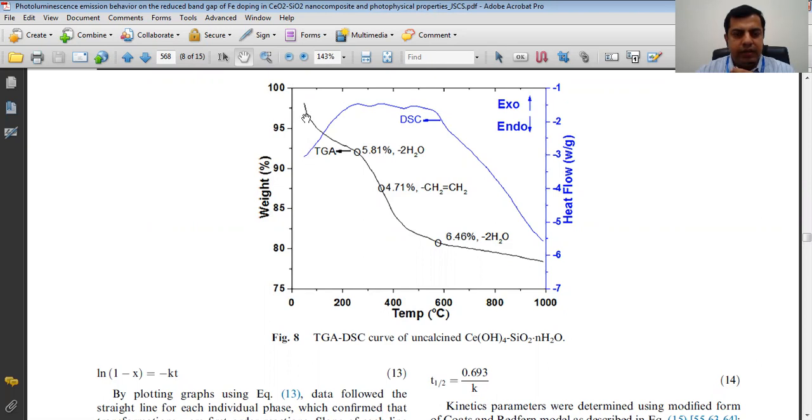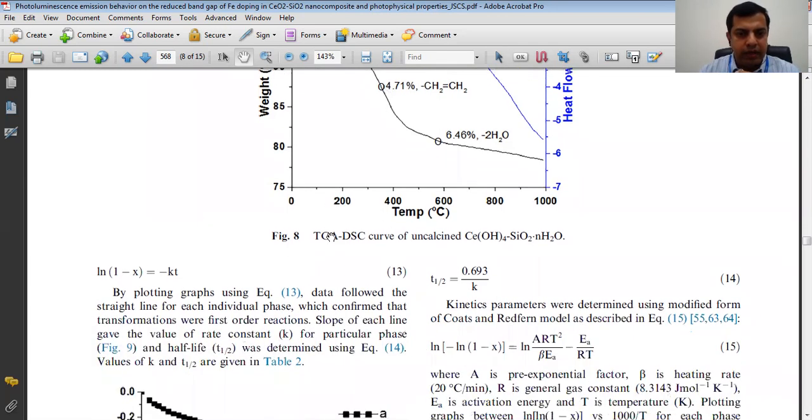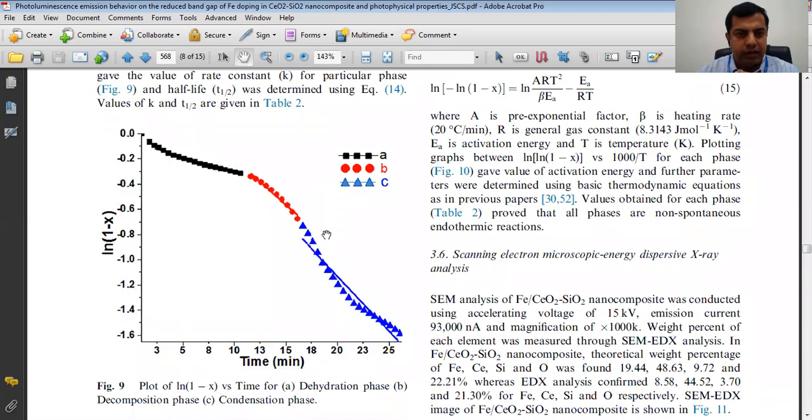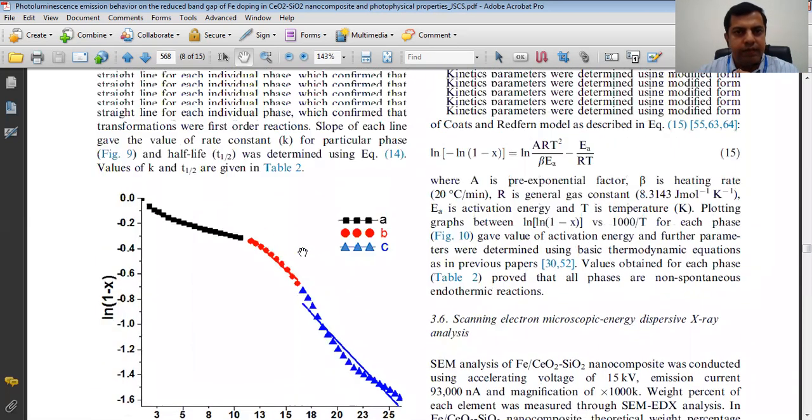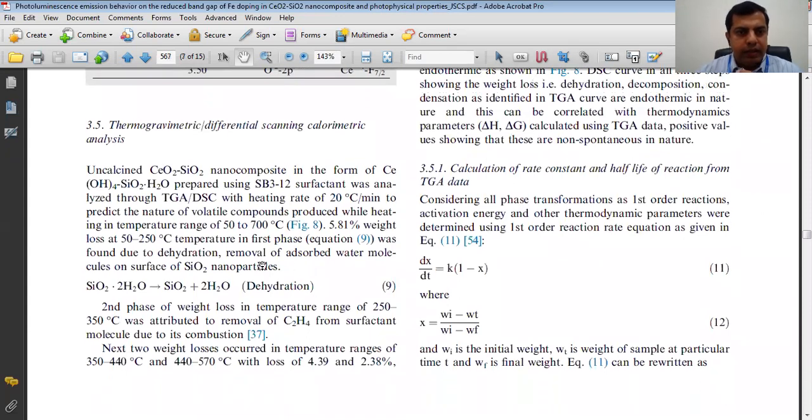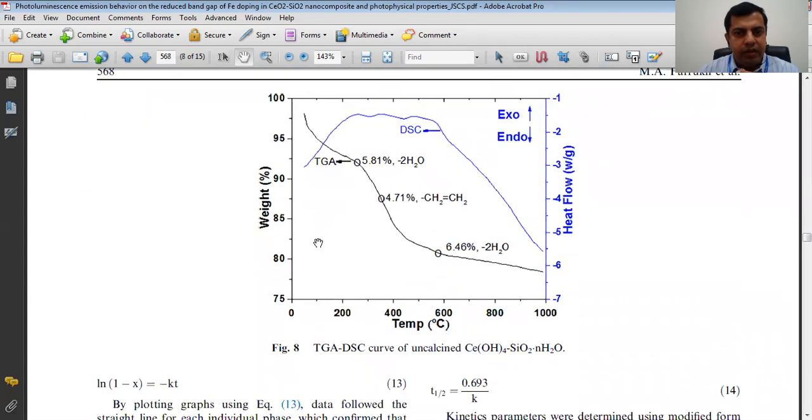There are three weight losses. The first weight loss is 50 to 250 degrees centigrade and having a weight loss of 5.81%. Let's start the characterization of this material by using TGA. This is going to confirm the removal of two water molecules and this you can easily calculate.